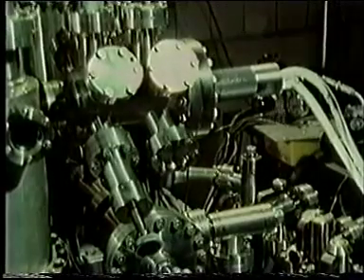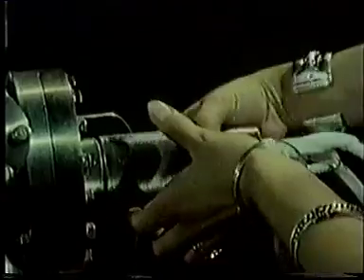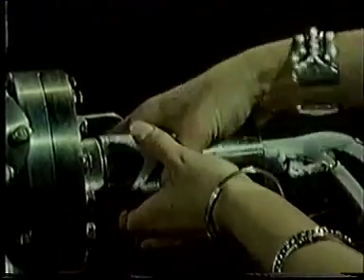Well, we can use a side chamber to perform the reaction at atmospheric pressure, then transfer the sample to the high vacuum spectrometer chamber. But can we be sure that it isn't affected by the pressure change? Our reaction was performed in the temperature range around 300 degrees centigrade. And of course, it's now necessary to look at the thermal stability of the different surface species under vacuum conditions. And this is listed in this table here.